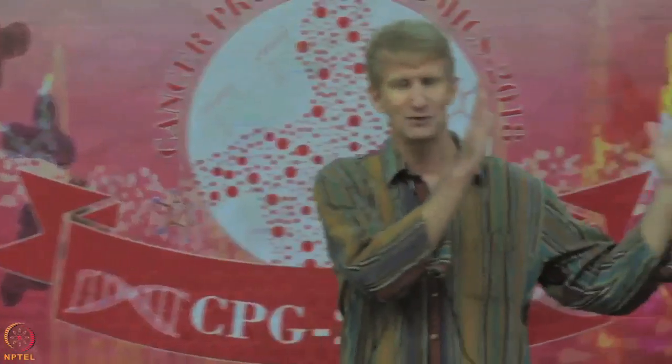But when you convert that parts per million into Daltons, that means it's a wider mass window at high mass and a narrower mass window in Daltons at low mass. So if your instrument data has your mass accuracy specifically in units of ppm, ideally you would like to use a search program that could also support mass accuracy in ppm units. But it is actually quite common to use a program where it only has Dalton mass accuracy. And so what you have to do is compromise and set the tolerance to only use the high mass one, when you should be able to, in principle, use it at lower mass and have a narrower tolerance.